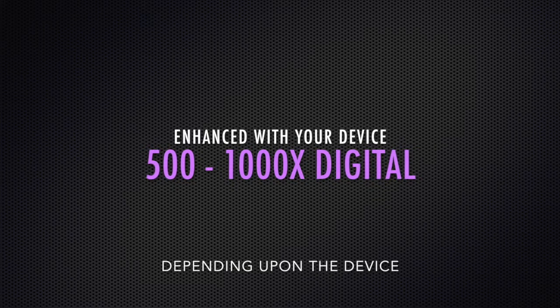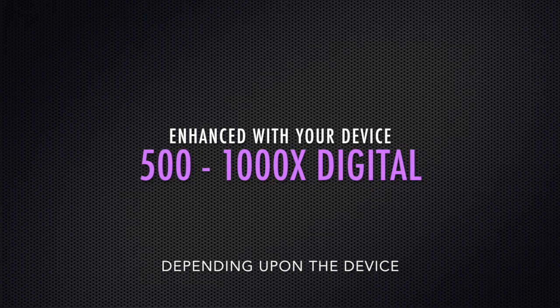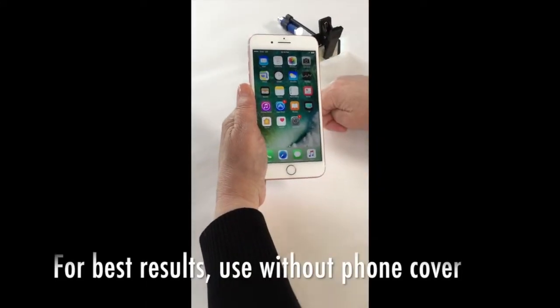And when paired with your device, it enhances anywhere from 500-1000x digital. Using the microscope is very simple.